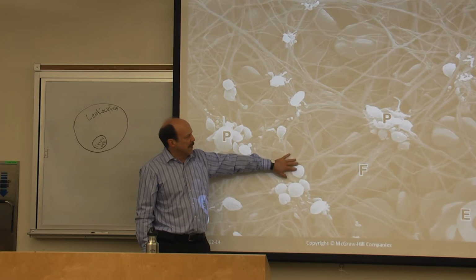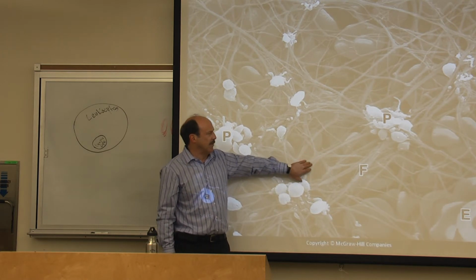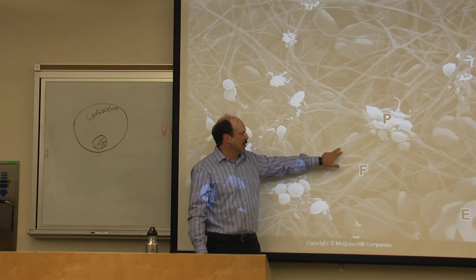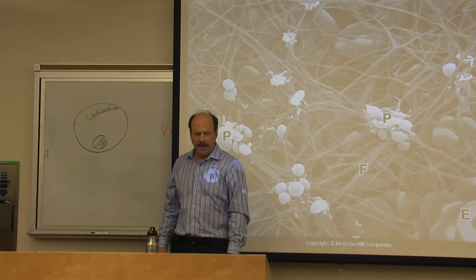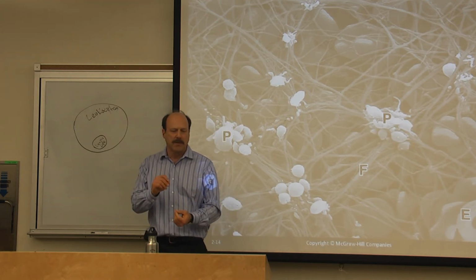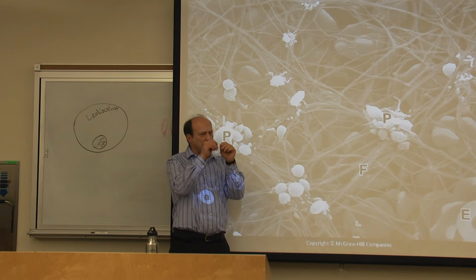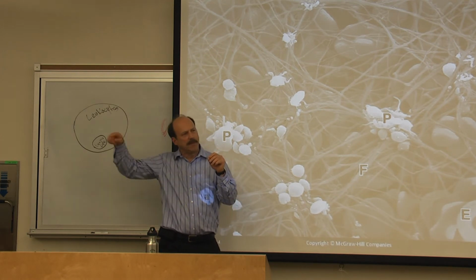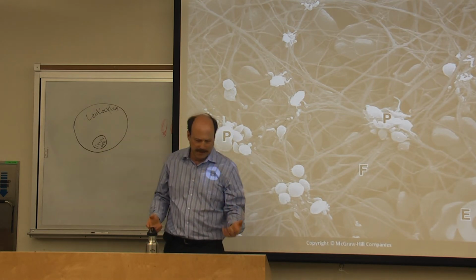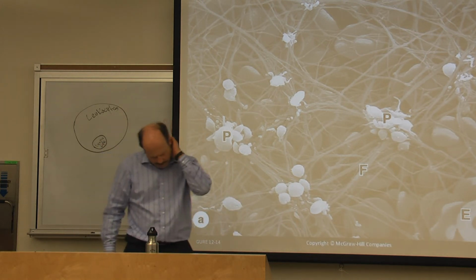Anyway, the scanning electron microscope, sometimes called the surface electron microscope, shows lots of detail. Even if the magnification overall is lower than a TEM, it's going to show you all sorts of detail that you just wouldn't see in a regular compound microscope or an inverted microscope. That's because you're beaming the sample with electrons, and the electrons are so small, they're smaller than the wavelength of light. You're limited in resolving power just by the size of light itself, its wavelength.